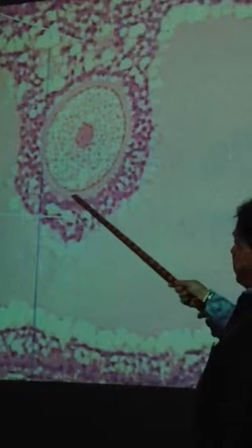All right, what are we looking at here? Ovum. This is a follicle. It's got a large antrum. See the antrum? Right? It's got the ovum, and then what's this area around it called? Anybody, real quick. Got to go through this quickly.